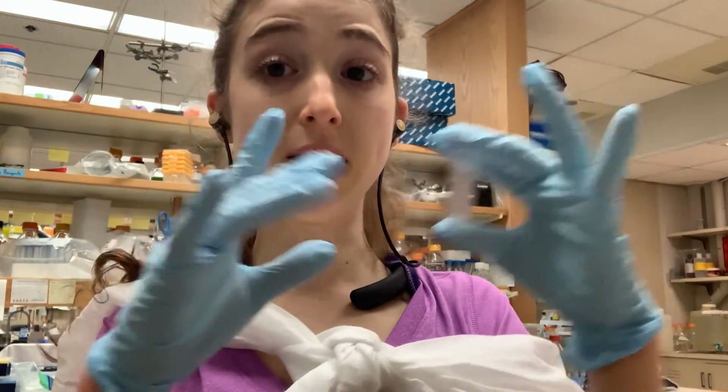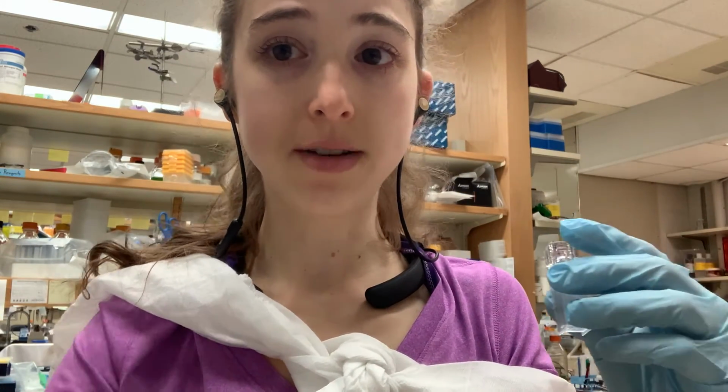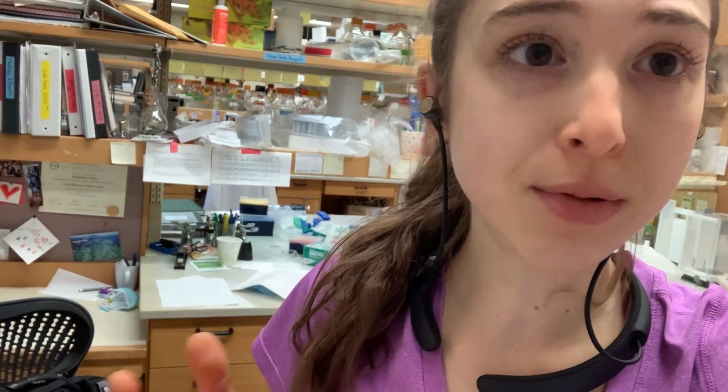And so this is going to be a shortcut that we can use to get an estimate of the concentration. Beer's law is going to let us get the concentration, assuming that your solution is pure, just that molecule. If you have other stuff in there that could also absorb, like proteins or salts, that could cause problems, which is why we're going to look at a couple of ratios of wavelengths and not just look at a single wavelength where we're doing the measurement based on the extinction coefficient at that wavelength.